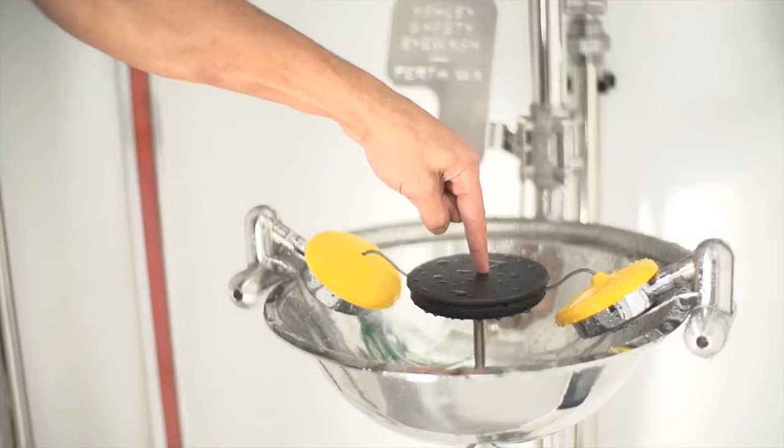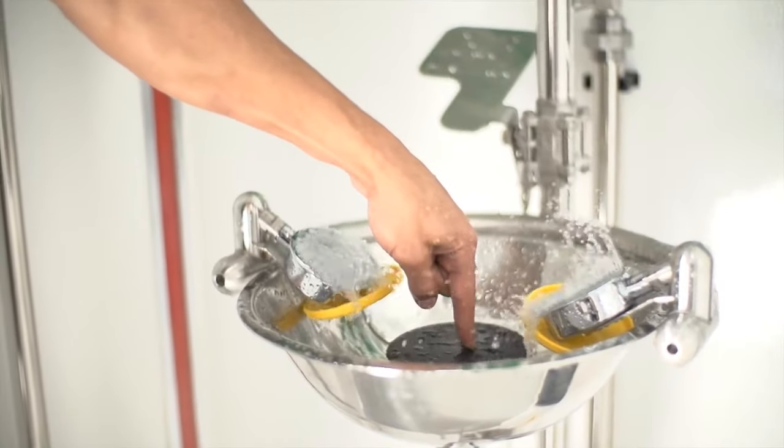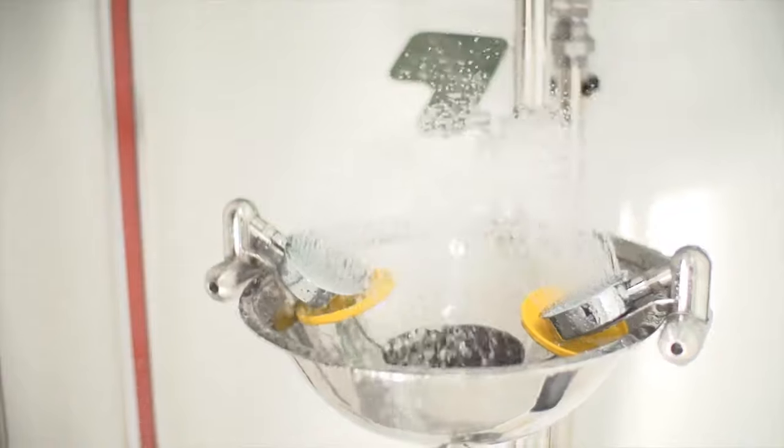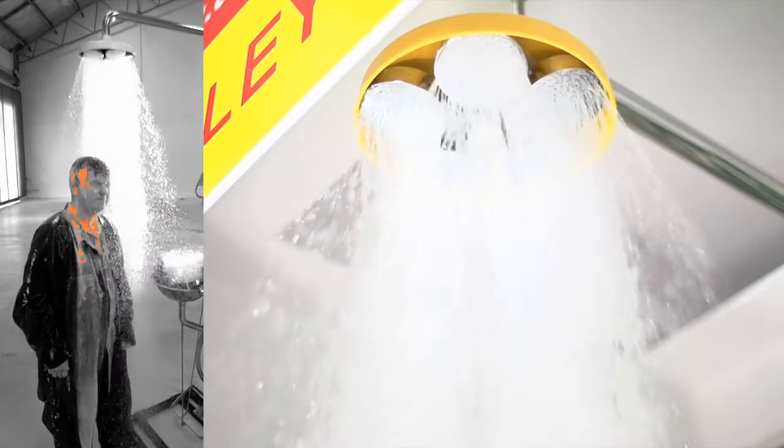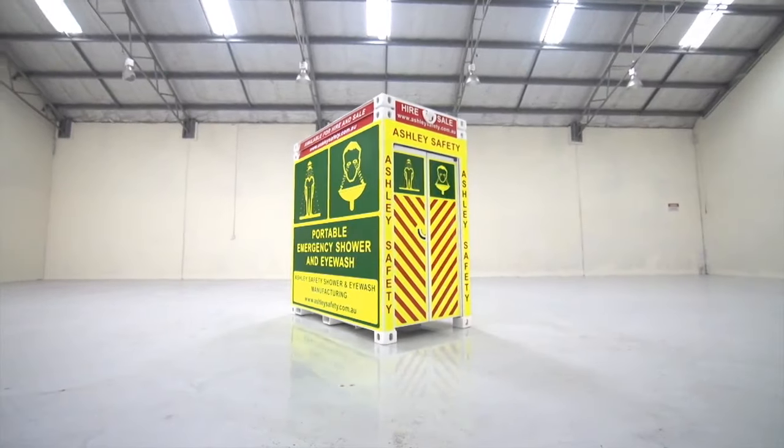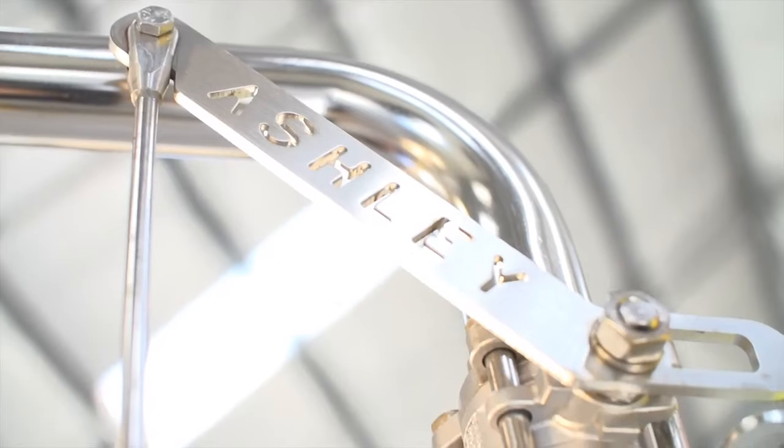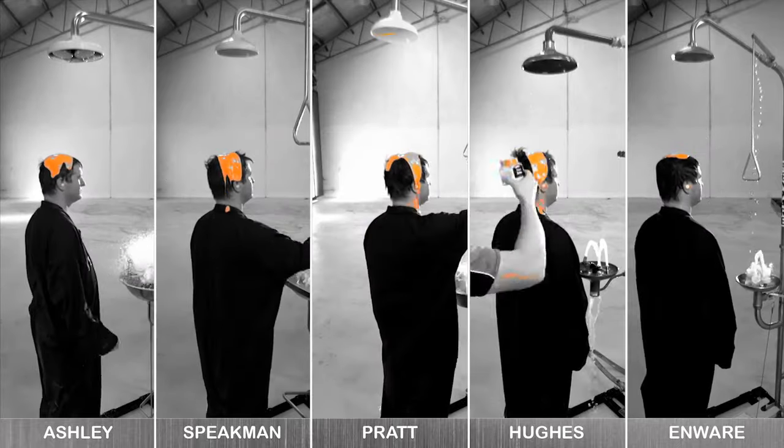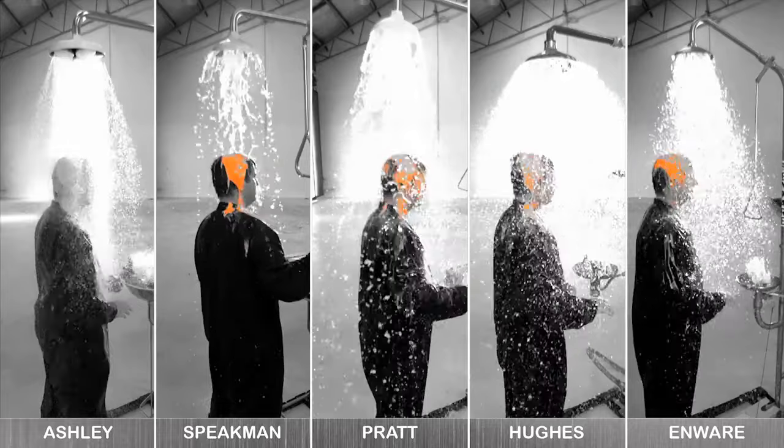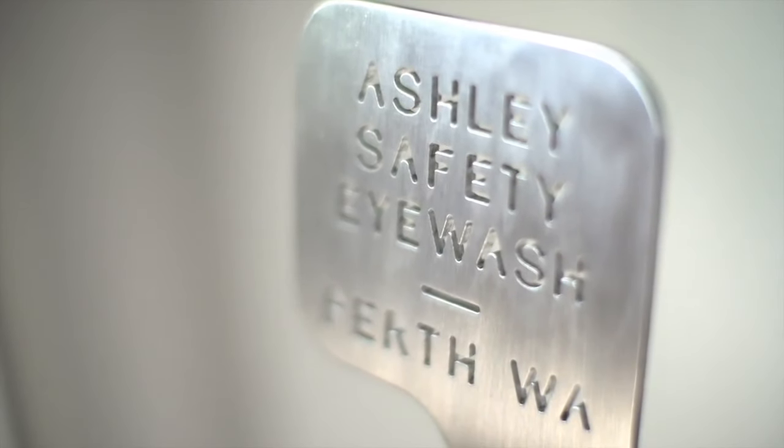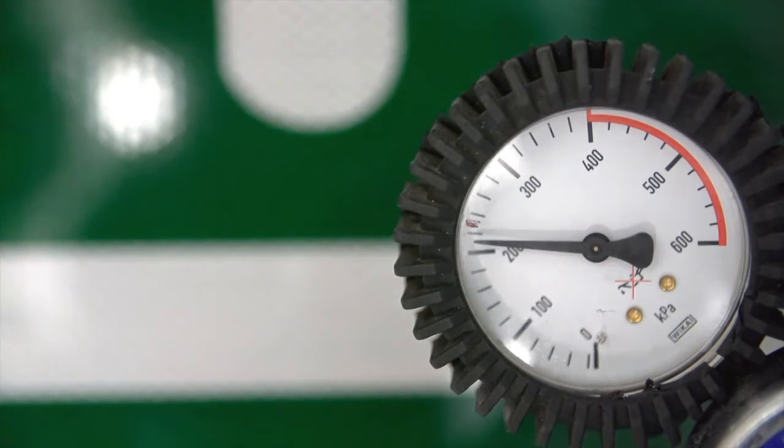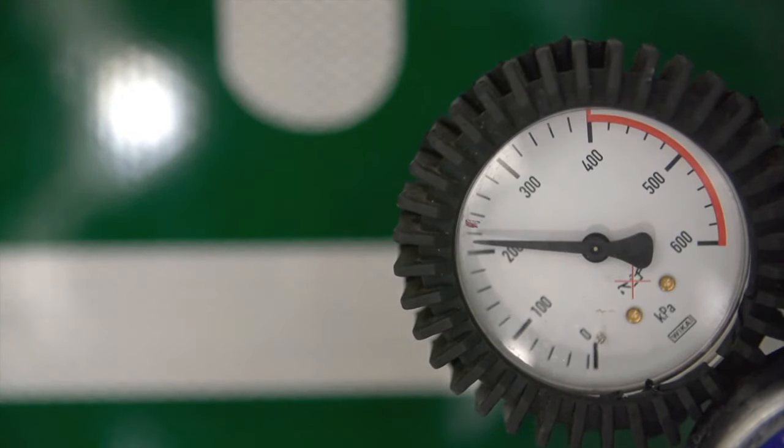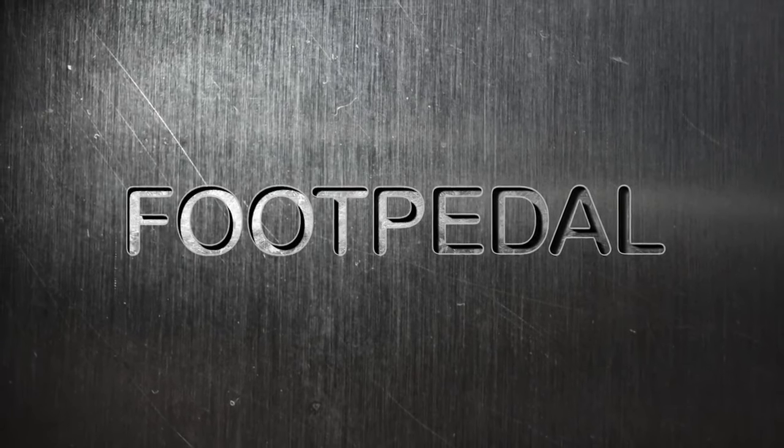Hello and welcome to Ashley Safety. Today we're going to demonstrate the superior build quality and design of the Ashley safety shower. We're going to examine each part of Ashley's shower and compare it to four industry competitors, and finally we'll conduct a simulated chemical burns test to see which of the showers really does perform under emergency conditions. In order for this test to be fair, we'll be using a controlled water pressure of 210 kilopascals across all five showers, as per American and Australian standards for safety showers and eyewashes. Let's get started.